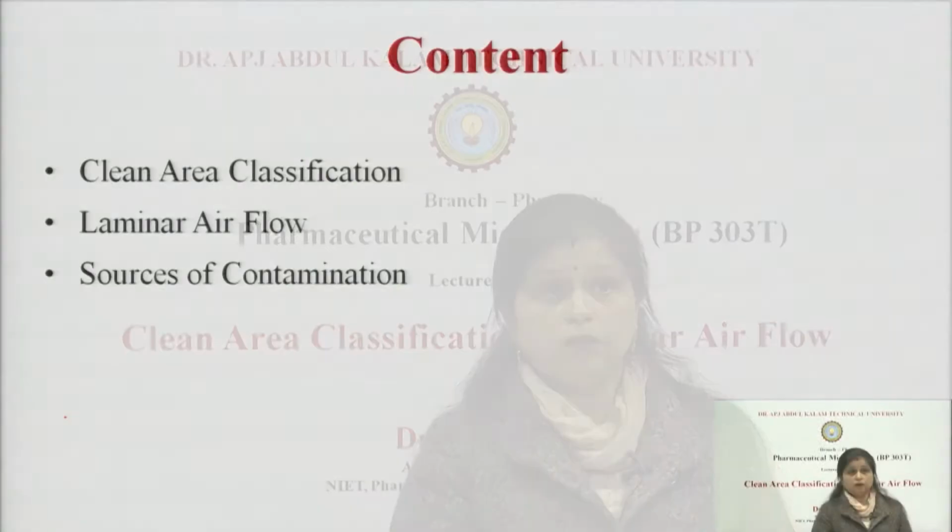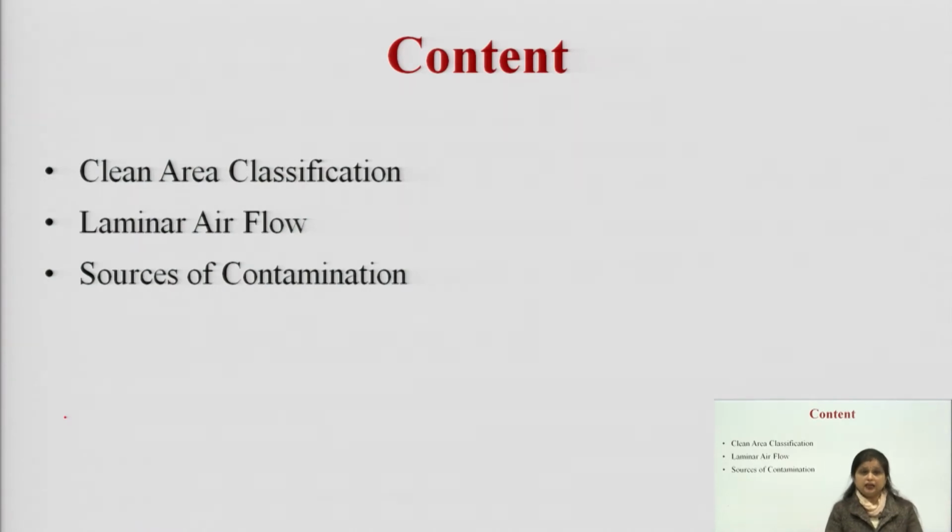Now, in this lecture I will move on with the clean area classification. In the last lecture I started with unit number 4, and in unit number 4 we covered the aseptic layouts based on clean area classification. I told you what a clean area actually is, and how we can classify our clean areas into various categories based on various guidelines.